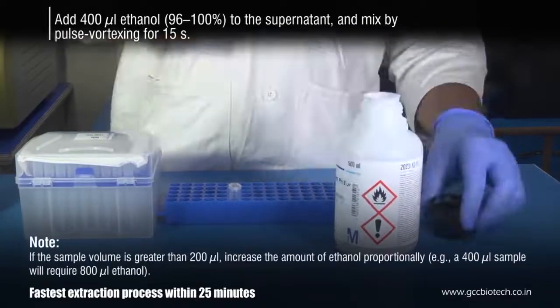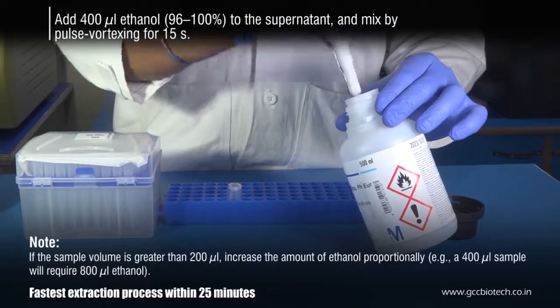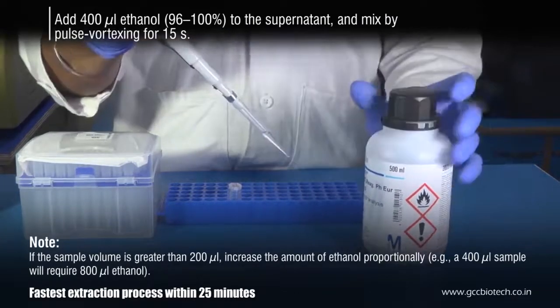Add 400 microliters of absolute ethanol to the supernatant and mix by inverting the tube 5 to 6 times.